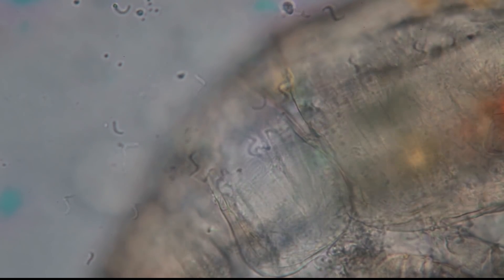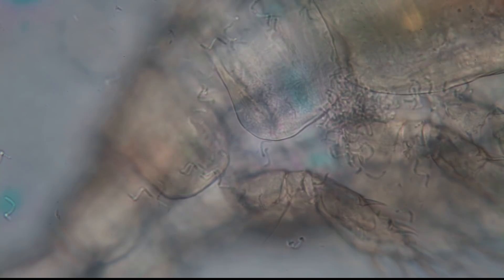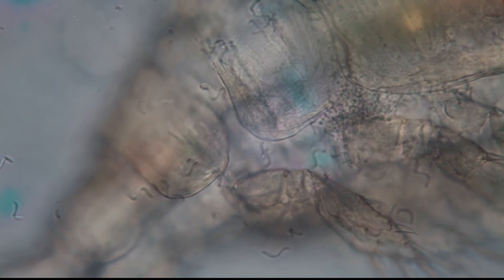And when I refocus a little bit, I can see that some of them are actually now sticking a little bit on the cover glass. So they are not moving around as much because they are a little bit inhibited in their movement. But you can see actually the spiral shape quite well. And now look a little bit further to the bottom of this image right now. You can see there is actually a large colony of these spirilla here right now. There are many of them growing on the belly side of this crustacean, just there where the legs are. And so this is a darker spot towards the center right. You can see that there are many of them sticking together.